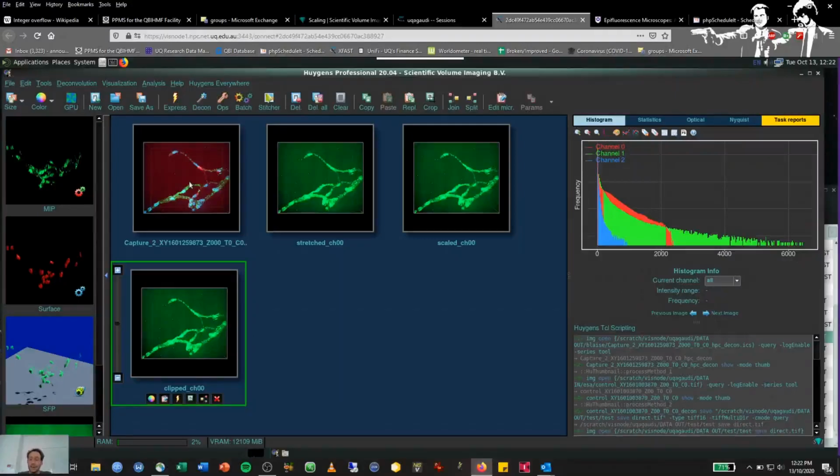And that is for when not only the relative intensities between your channels are important, but you do some quantitative estimation of the signal that you are recording when you acquire images, and therefore you don't want to interfere with it. So the rescaling is out of the question.